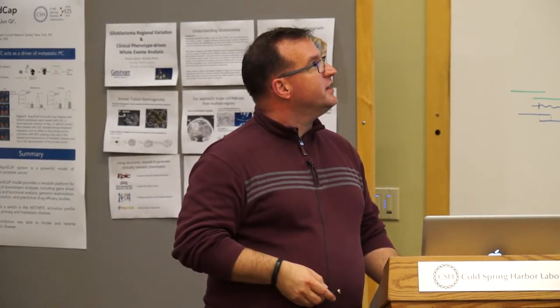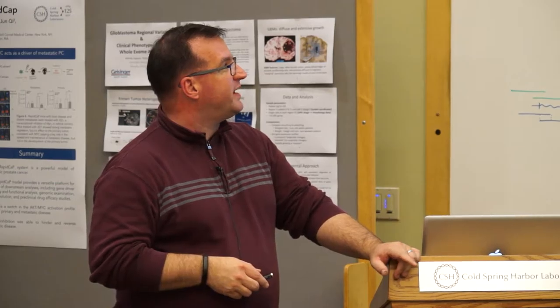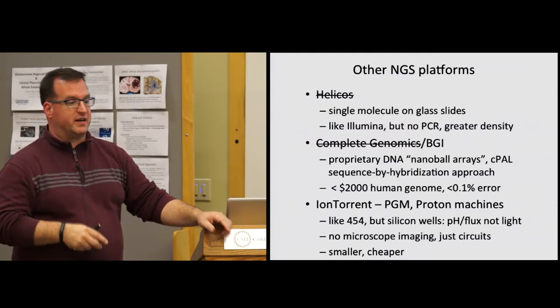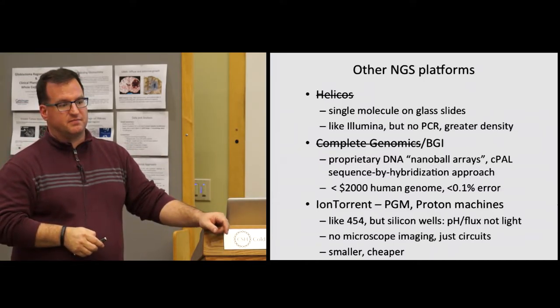Okay. Great. So other sequencing platforms that we've talked about in previous years that we no longer talk about: Helicos was a great idea, just like Illumina, but with no bridge amplification. Essentially, individual spots, where the spot was a single piece of DNA on a glass slide, with very ultra-high resolution microscopy, such that in each cycle, as you floated in those fluorescent labeled nucleotides, you would see the individual incorporation of a single nucleotide as a very, very tiny flash of light. Very sophisticated technology. The machines were outrageously expensive because of the sophistication of the microscope and the scale at which it was measuring light.